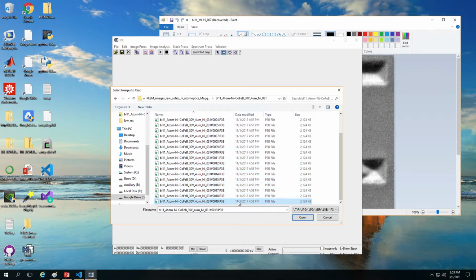All right, so now if we want to process the high resolution images, let's go all the way to the bottom, 19, and some photos have 40 images, so you want to keep a note. Maybe you make an Excel sheet while you're processing one big photo, of how many images you were actually using for the high resolution images.